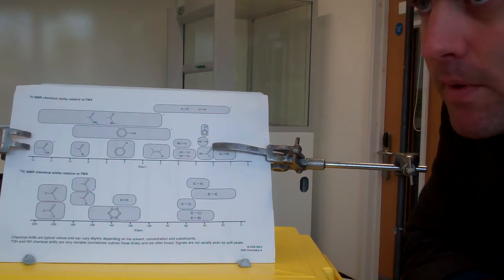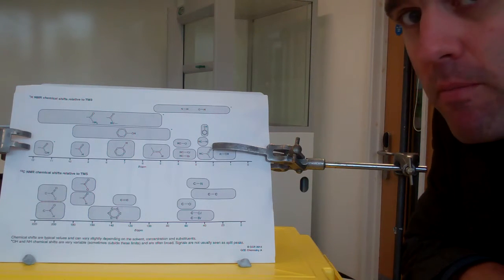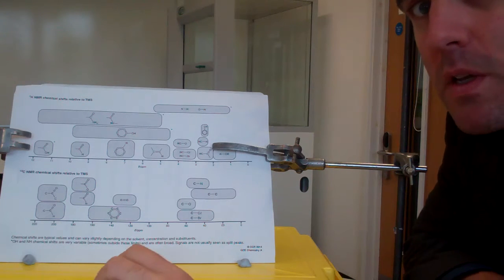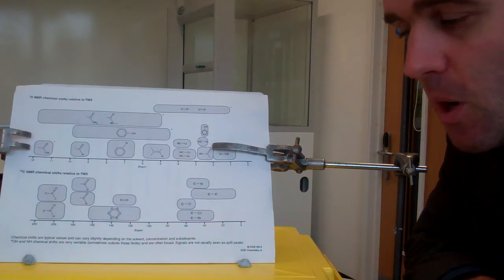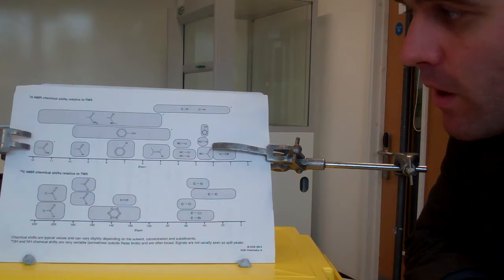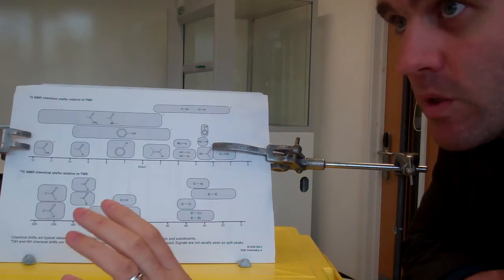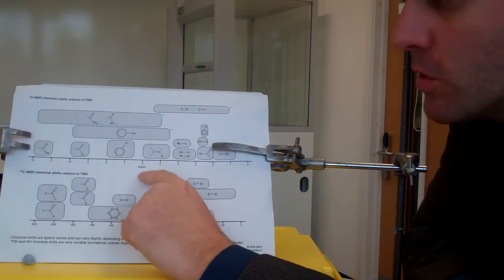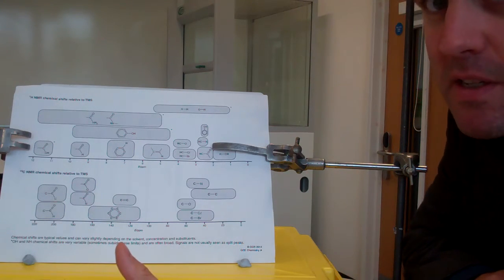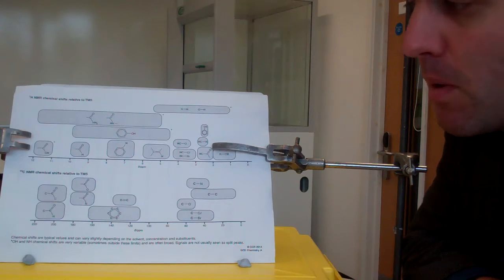So basically what happens is your sample realigns itself with the magnetic field, going from low energy to high energy state, and when it does that, it absorbs some radio waves to be able to jump from one energy level to another. Now you don't need to know much about that, but what you've got to realise is when those radio waves are absorbed, what frequency of radio waves it absorbs corresponds to where the parts per million is, and different hydrogens and carbon-13s in different environments will absorb at different frequencies and hence have different parts per million.